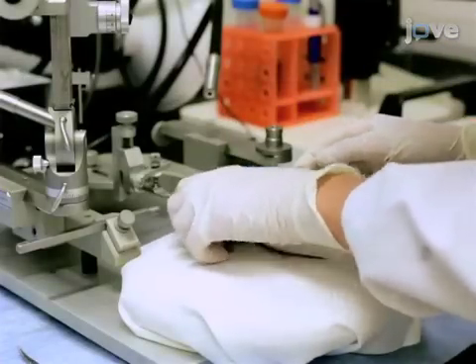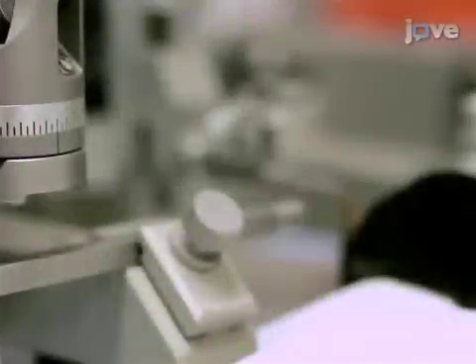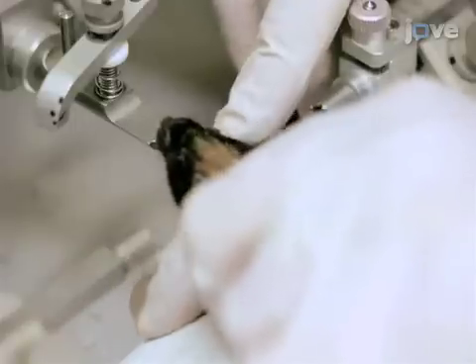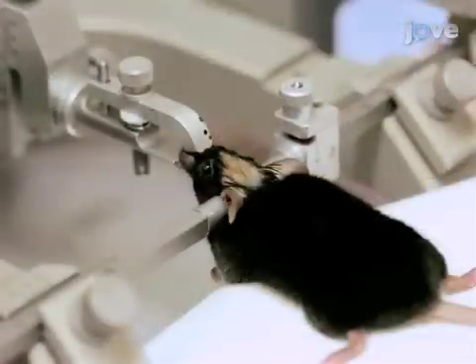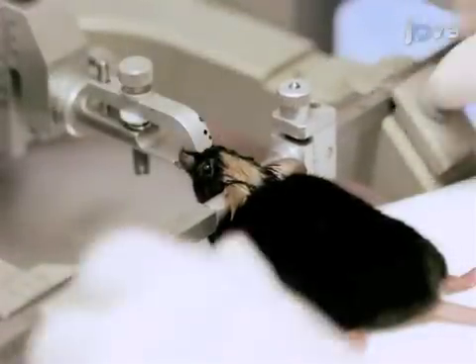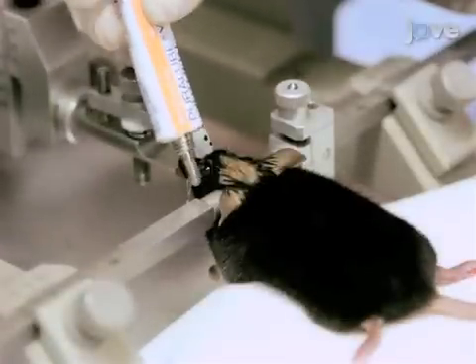Then, transfer the mouse to the heated pad on the stereotax. Zero the tooth bar and ear bar scales and set the mouse's teeth in the tooth bar. Screw in the muzzle and the ear bars. If any wiggling or whisker movement is noted, administer a booster dose of ketamine-xylazine cocktail. Then, lubricate the eyes to prevent them from drying.